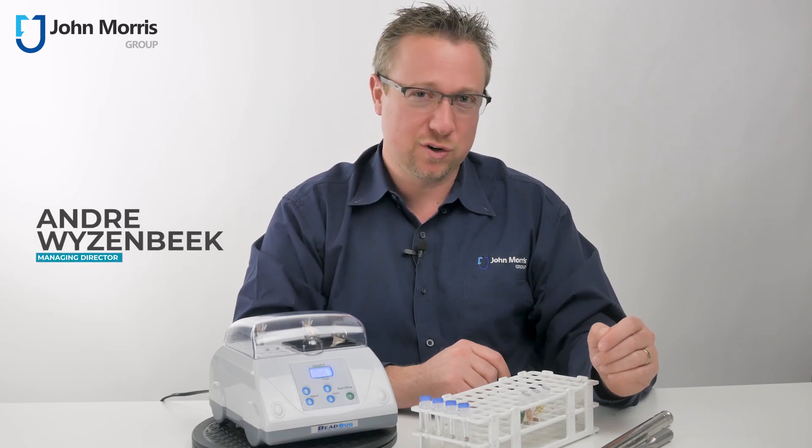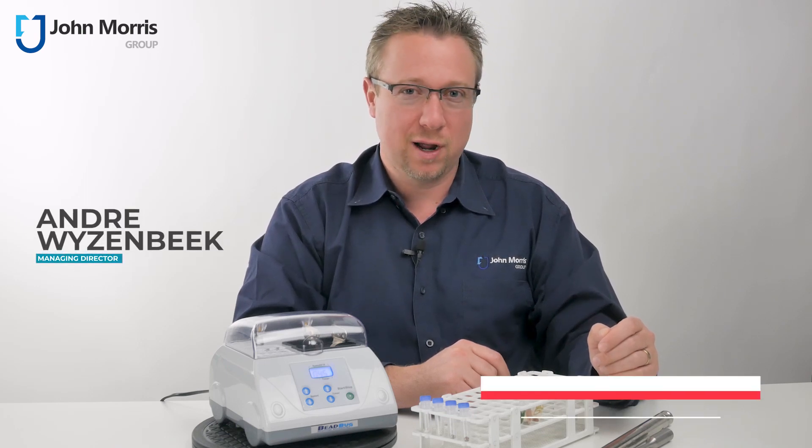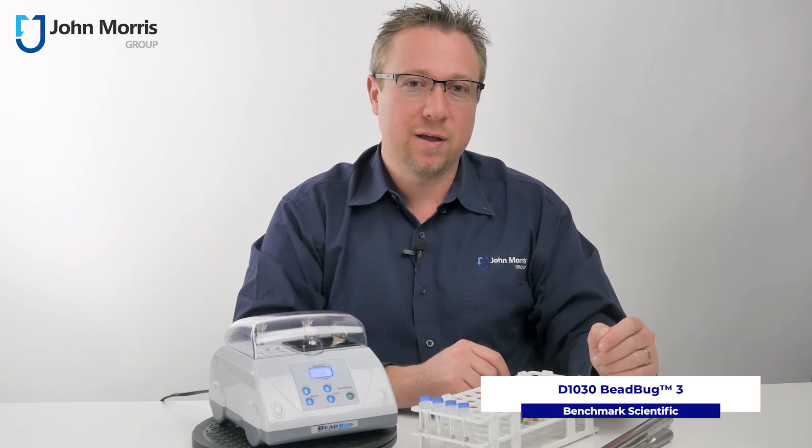Hi, I'm Andre from the John Morris Group and today we're here to do a Prolac review on the Beadbug 3.